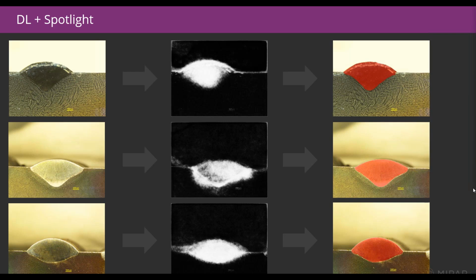So the Spotlight algorithm itself would still run on a per slice basis, and that's how we would deploy it in the three-dimensional space. We're still first and foremost a 2D analysis platform. I'll say, to be upfront, maybe 5 to 10% of our users are in the 3D space.